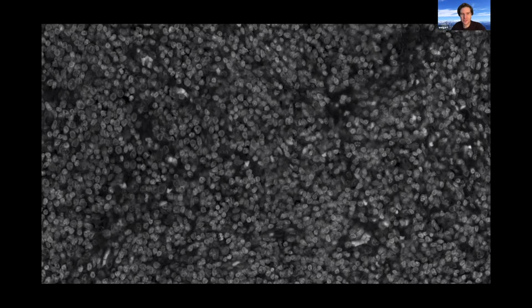So you could label hard cases with a different class, so to speak, in order to filter them out later. Because if you never want the out of focus ones, just don't annotate them. Then this object probability will take care of that and give it a low value, and it will not be picked up later. But if you want them sometimes, you could give it a different class, and then you can filter them out on demand based on the application. So these are options. Sometimes you just need to try it out and see what happens. It's very hard to give general guidelines.